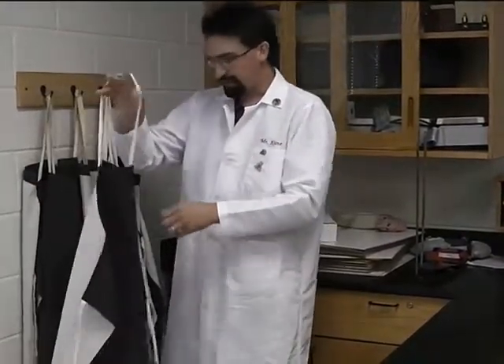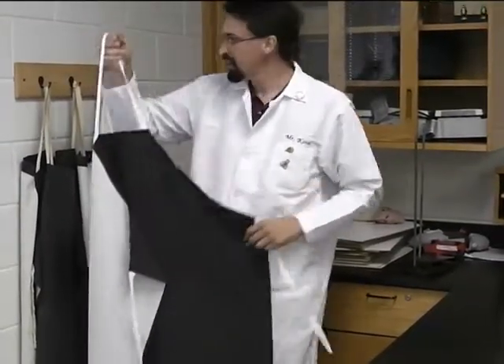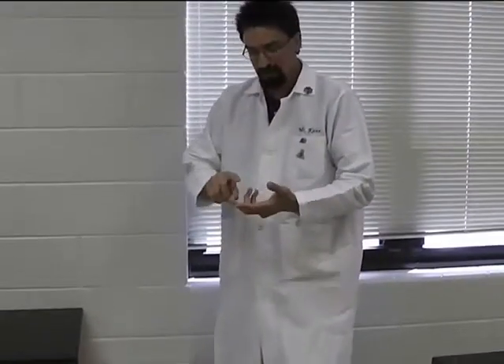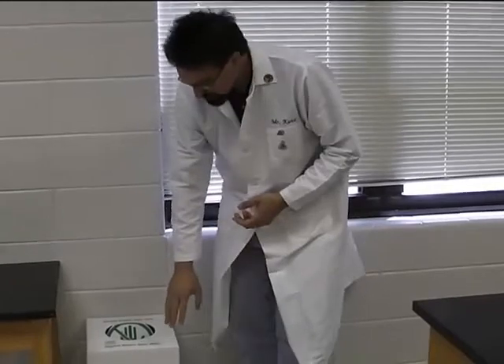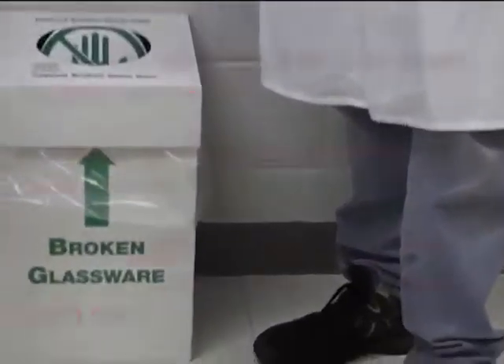There are some optional lab pieces. You can see that Mrs. Goswish and I are both wearing our lab coats. You will not have lab coats due to space, but you do have lab aprons, available in the back anytime you want to use one. If glass breaks — which it does — number one, let your instructor know. Number two, never pick up broken glass with your hands; always use a broom and a pan. And anytime you have broken glass, always put it in the broken glassware container. Never throw trash into a broken glassware container.